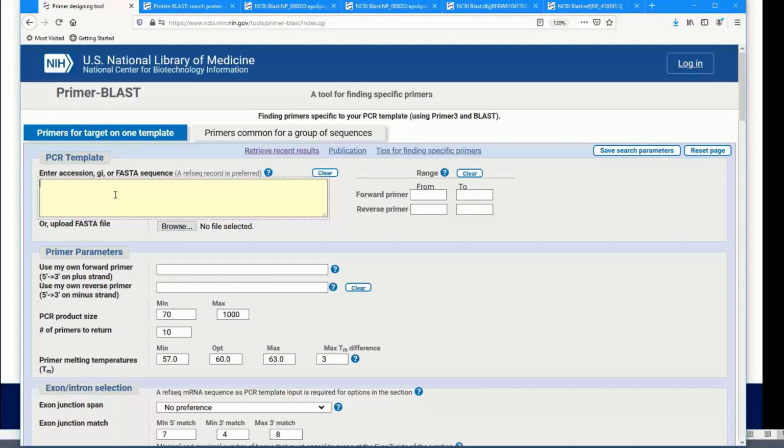I can understand how it's useful. I myself have done that in the past, but there isn't a simple way to do it in Primer Blast. Part of it has to do with the blast search, because blast doesn't work with degenerate codons, or in places where you use one of those bases like inosine and things like that. So no, it's not possible right now.